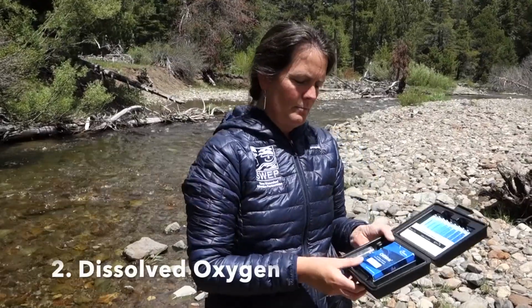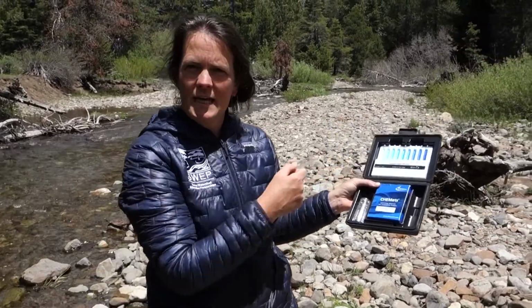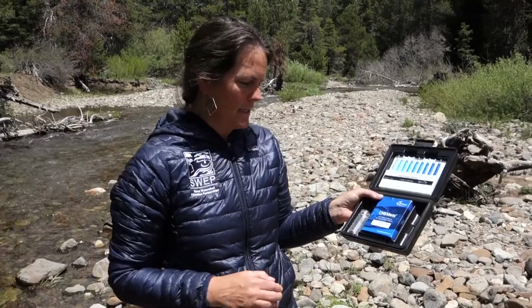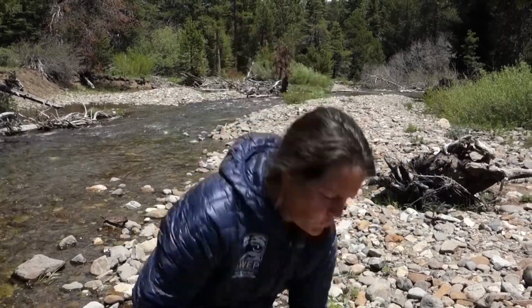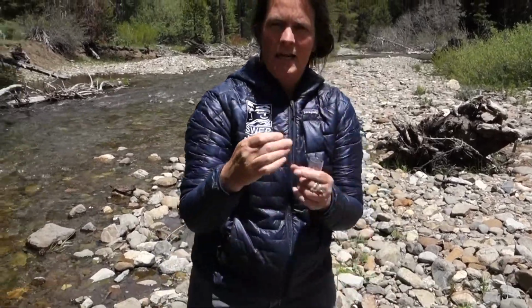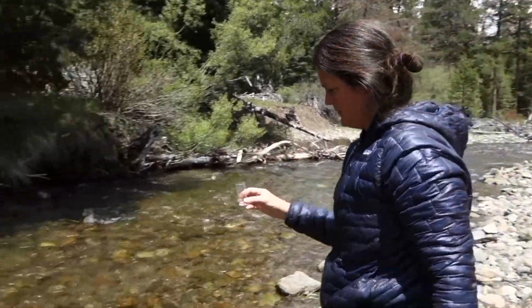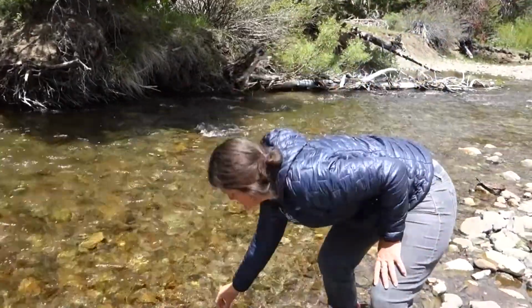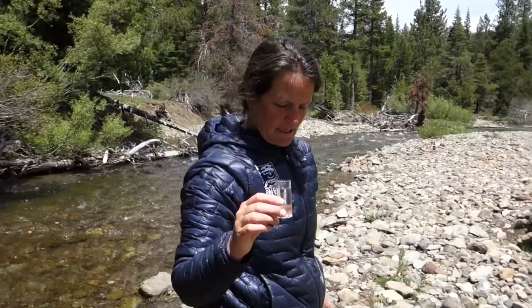So the next thing we're going to measure is the dissolved oxygen, the amount of oxygen in our creek. And we're going to be using a dissolved oxygen test kit to collect this data. There's a small sample cup inside of your test kit, as well as an ampule. So you're going to leave your ampule with your test kit, take your sample cup down to the creek, scoop up some water, and you can bring it back to your test kit.